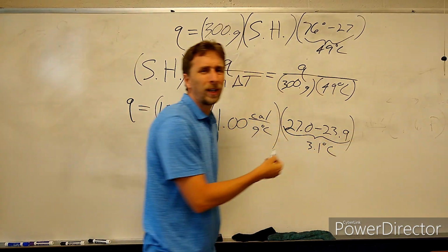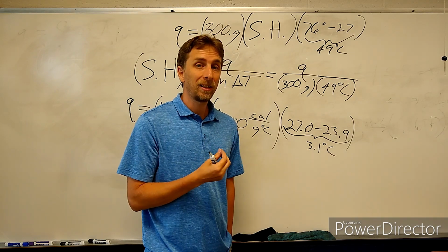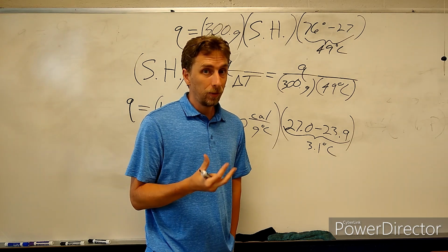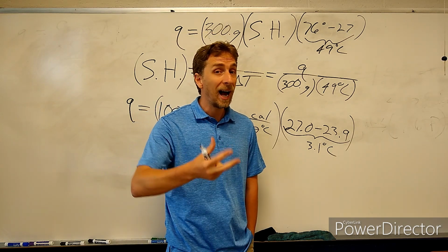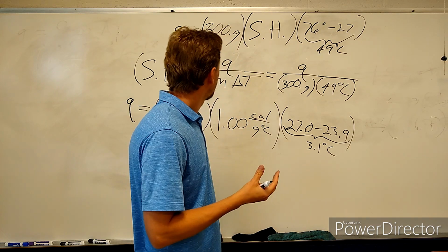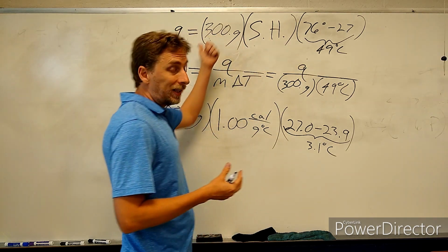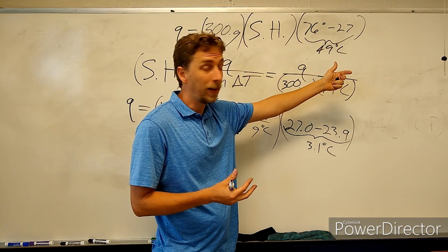So that is an important observation because water can absorb a lot of heat or release a lot of heat without changing temperatures very much. That's an important property. You refer to that as a high heat capacity of water. As opposed to glass, well, from the evidence here, we're talking about the same heat absorbing, or in this case, giving off the same amount of heat.